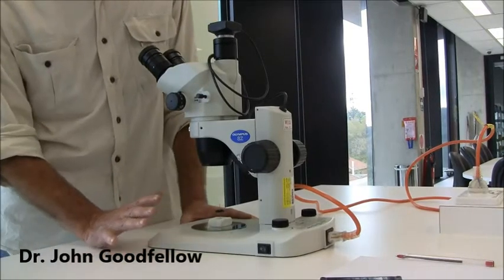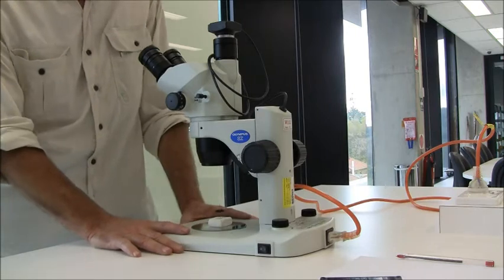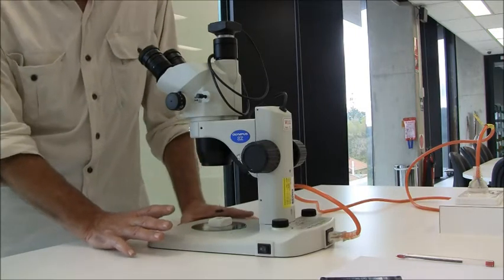This demonstration is on the dissecting microscope, a microscope that you'll use in molecules, genes, and cells, and a little bit more in biology of organisms.